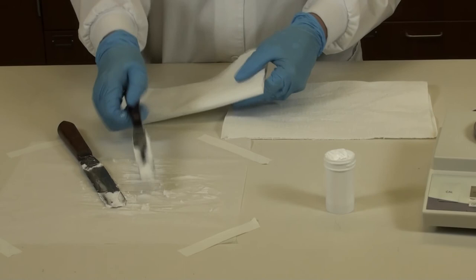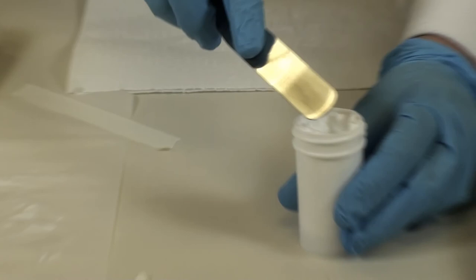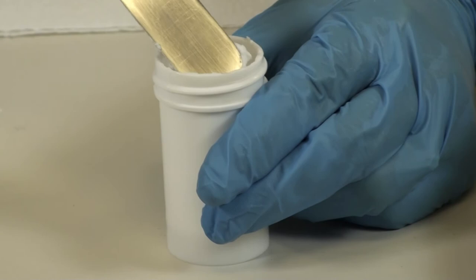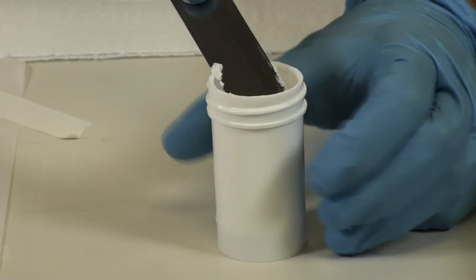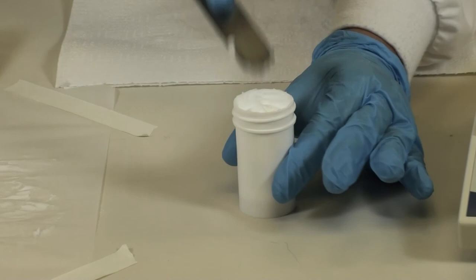All right, you need a clean spatula in order to dress your cream. So go ahead and wipe the excess off. And you want to go ahead and push the cream down from the sides and hold your spatula at about a 45 degree or even a little larger angle so that when you turn the ointment jar, it smooths out the top of the cream.